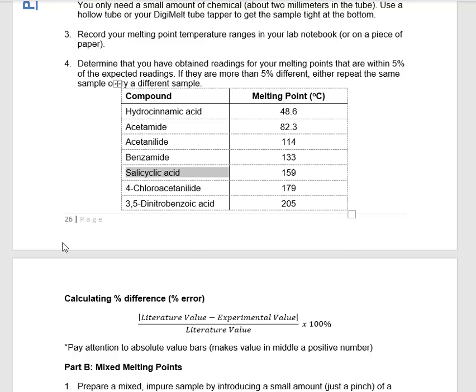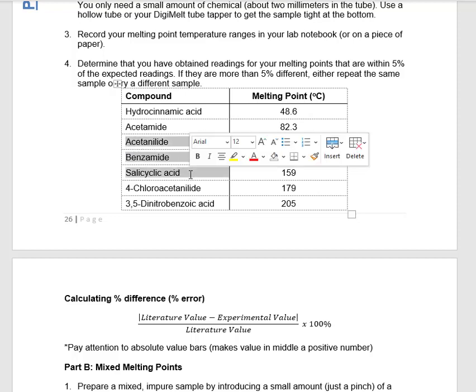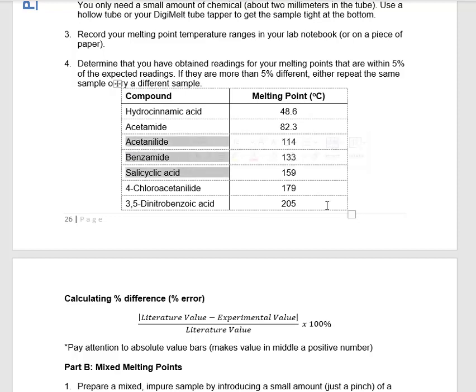because then what you're going to have is a mixed melting point. What you should see is either a huge decrease in the melting of your unknown, or you're going to see some solid stay behind as one piece of the puzzle melts, right? Because now each one of your samples is a mixture of 2 compounds, right? It's your unknown plus one of these 3, right?